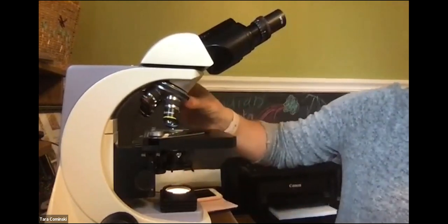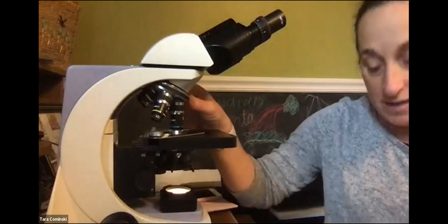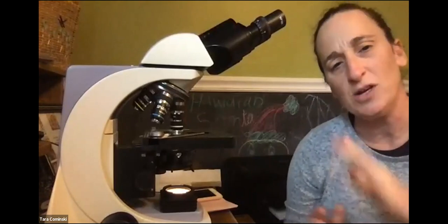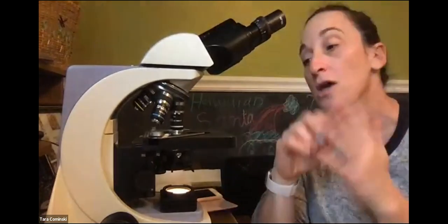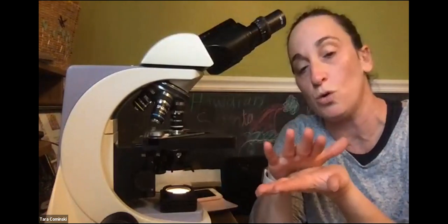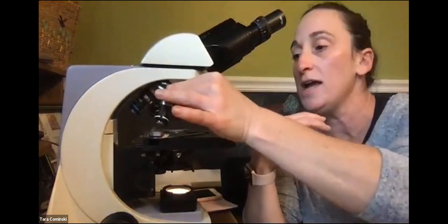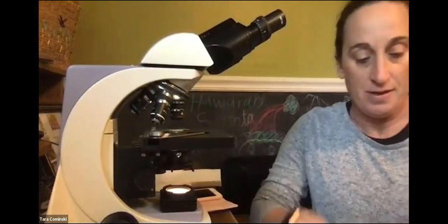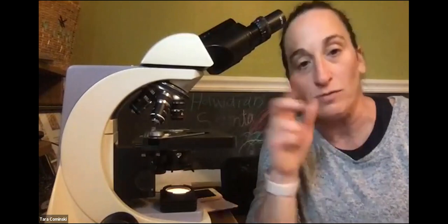If we now move to the next one, that is the high power objective, and that is 40x. The last one that's here is oil immersion, and that one is 100x. We usually don't use that in this course. You'll use it a lot in microbiology. The reason it's called oil immersion is that you have to put a little drop of oil there because the objective has to get so close to that slide to give that image and that magnification. All right, I'm going to go back to the 4x there. Like I said, you're going to fill in that diagram. You will be responsible for knowing those when we have our practical or lab exam.